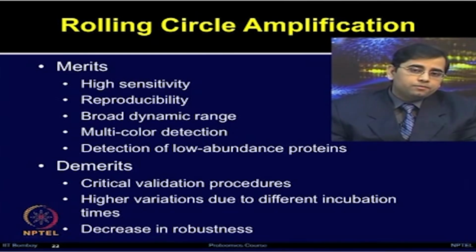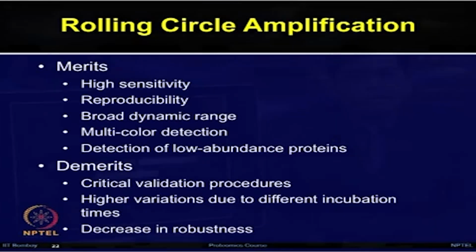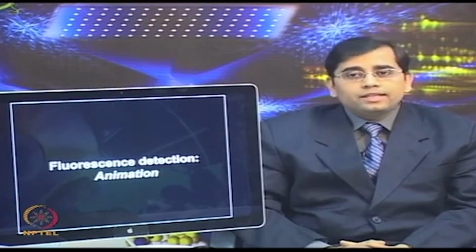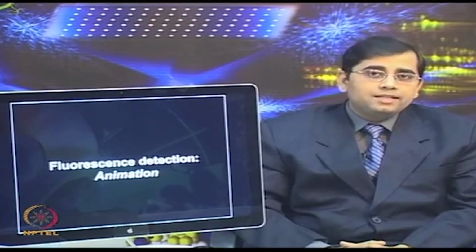Its demerits include critical validation procedures, higher variation due to the inherent incubation timings, which are different for these assays, as well as a decrease in the robustness of the assay. So, I will show you a generic scheme of fluorescence detection by using this animation.